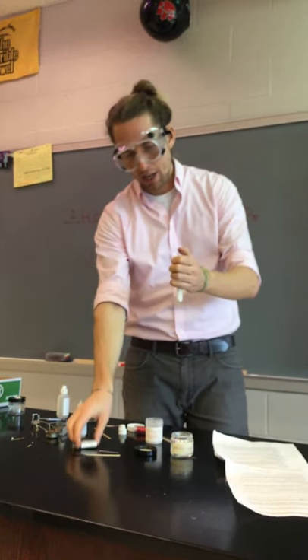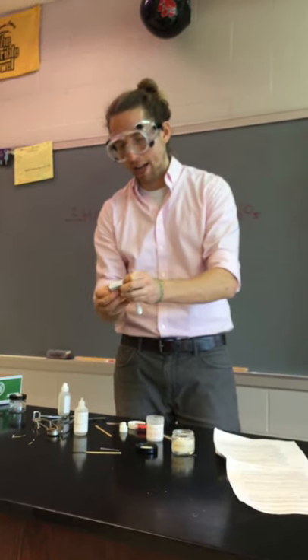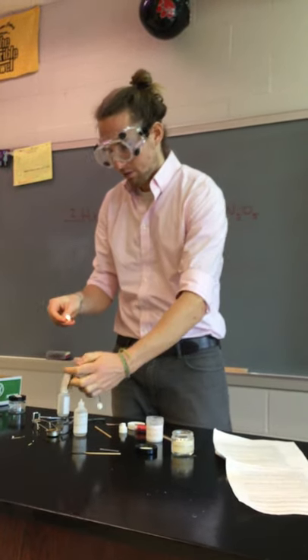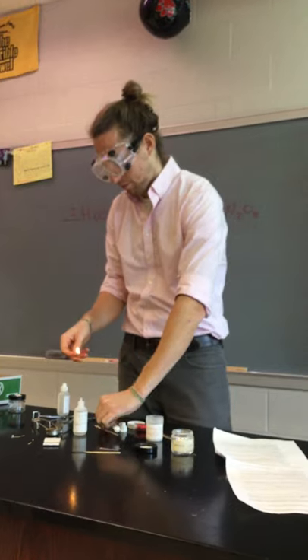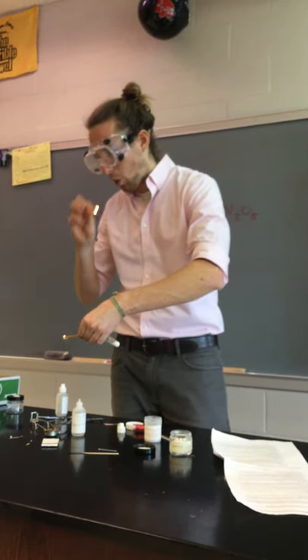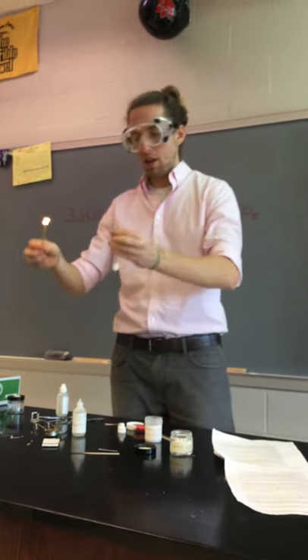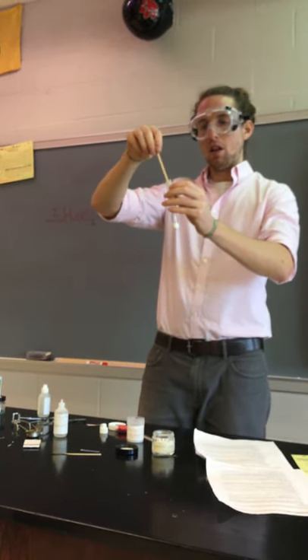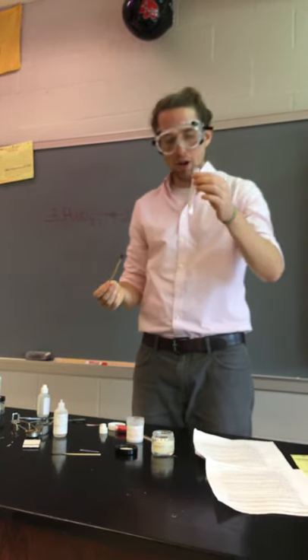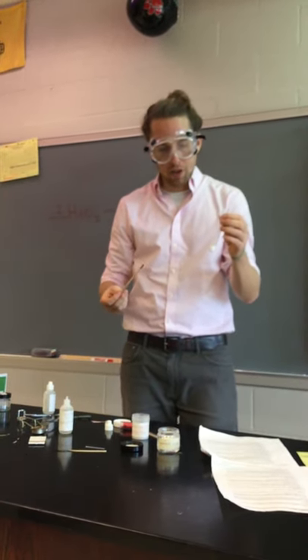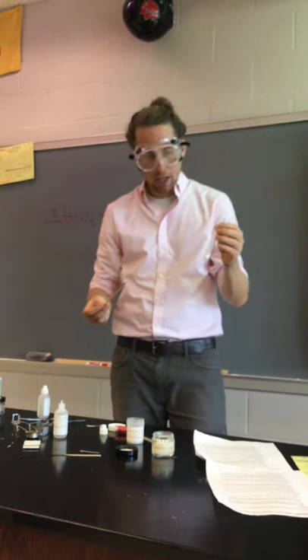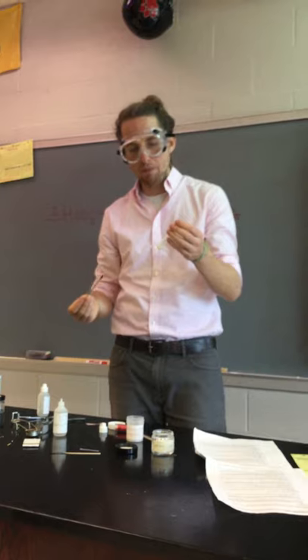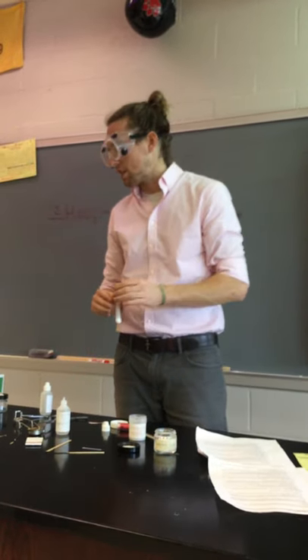When I put in the hydrochloric acid, you'll immediately see bubbles being given off from the reaction. That's good evidence of a gas. Let's quickly see if we can ignite some of that gas. All right, so we're again going to ignite the gas coming off of this reaction. And again, we have put the splint out. So that was with calcium carbonate that we reacted with hydrochloric acid. And again, the splint went out. So the question is what sort of gas might be being given off to make the splint go out.